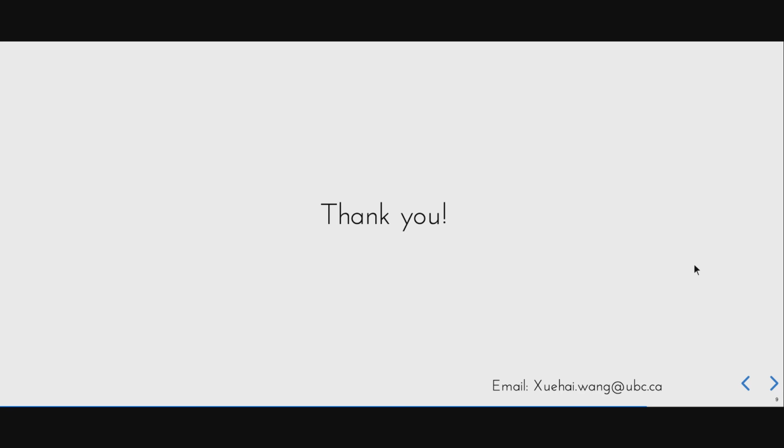But as I mentioned in the future directions, we are currently actively working on a panel-agnostic approach. That means the next generation of our flow could hopefully be applied to all different panels, as long as it is a panel for LPD diagnosis, and hopefully AutoFlow 4.0 will be able to analyze and generate results.